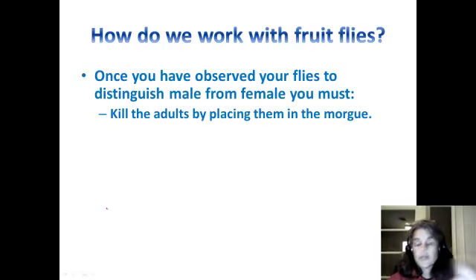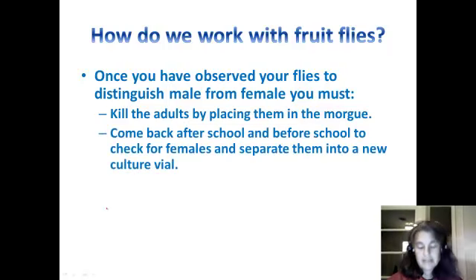Now, that means once we have observed male and female out of our culture, we're not going to return the adults back into the vial. We are going to have to kill them. Sadly, that is what is done. There's fruit fly mass murder going on every day in genetics labs because this is how you have to handle them.